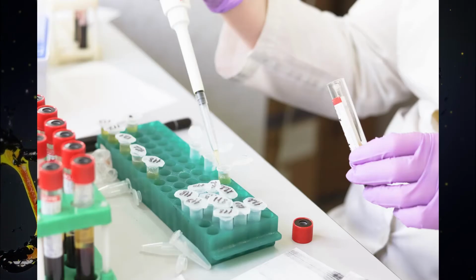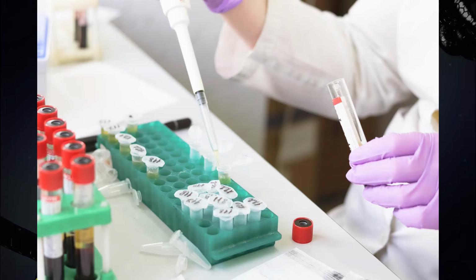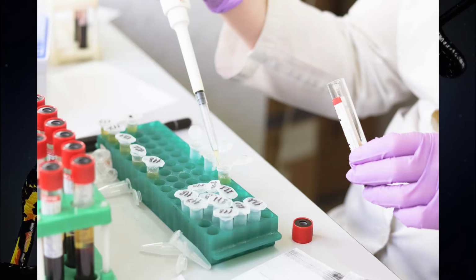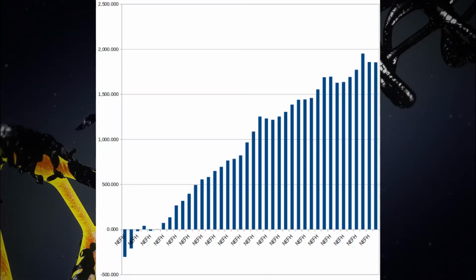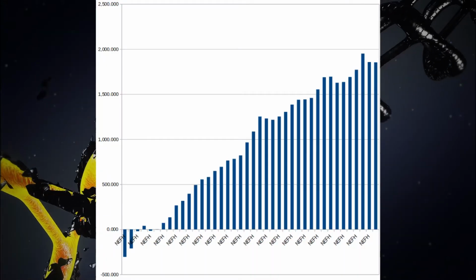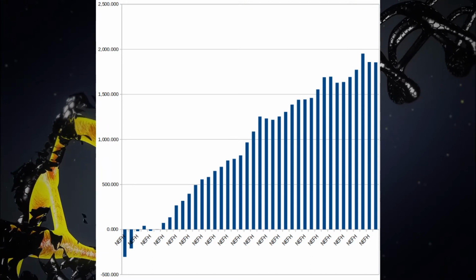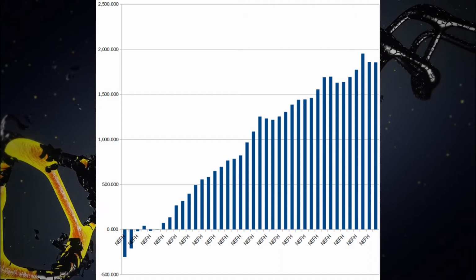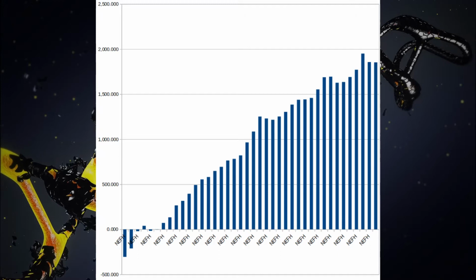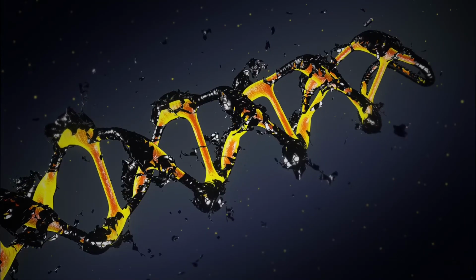Quantitative or qPCR is the most common and regular form of PCR used. Fundamentally, it quantifies the amount of DNA at the start of the sequence, and then measures it right throughout the process. This gives you something of a curve, and that curve will tell you how many copies are being created over time. It has a relatively high degree of precision because you can see that change over time, and often uses a number of different fluorescent dyes, SYBR Green being a very common one.